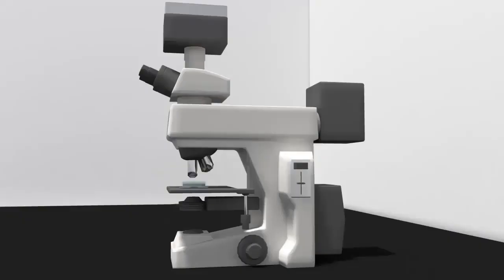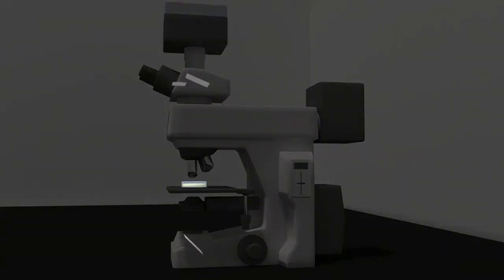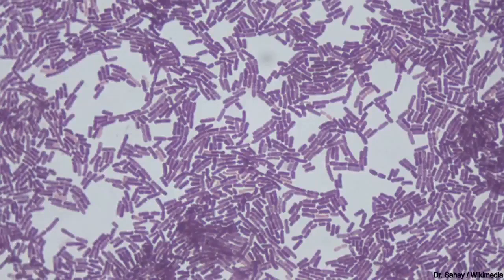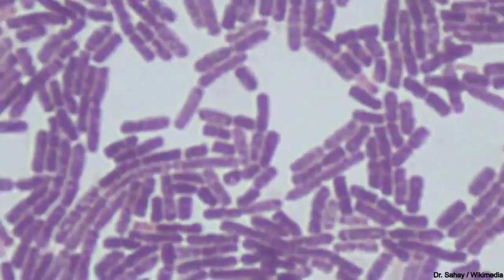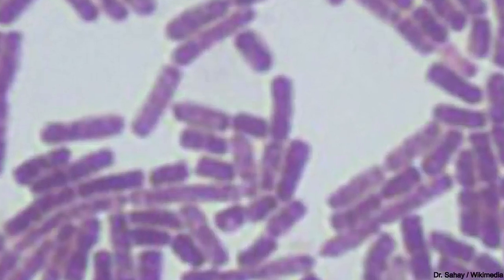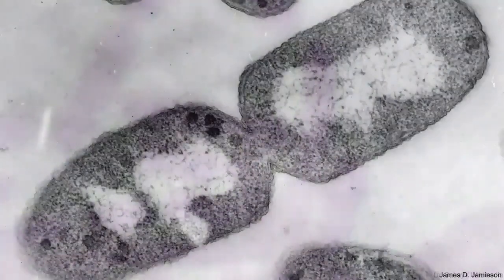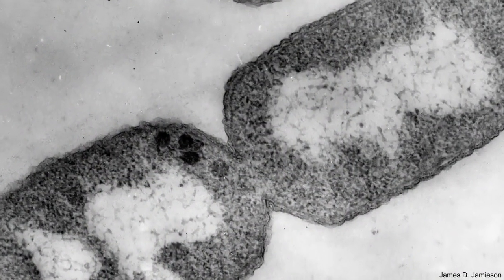viewed at this distance. In a standard light microscope, the sample is magnified or appears larger by transmitting and focusing the light from the light source onto the sample on the stage using the condenser. The image of the sample is then magnified through a series of lenses in the objective and can then be viewed by the eye through the eyepiece. The amount of magnification that can be achieved by a light microscope is limited by the wavelength of light. As a result, objectives higher than 100x are not used on a light microscope, as it will have reached the limitations of its resolution. If a higher magnification is desired, then other microscopy techniques, such as electron microscopy, are used.